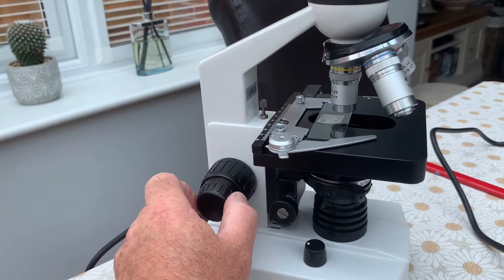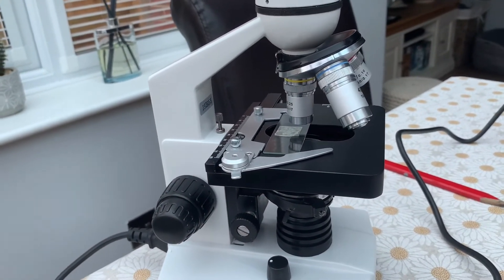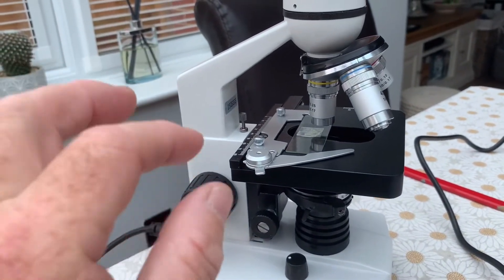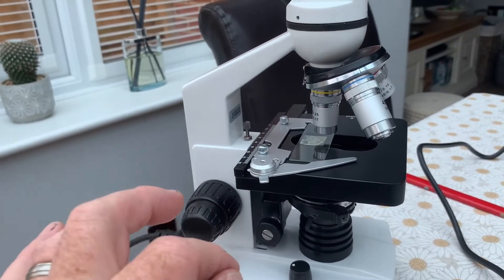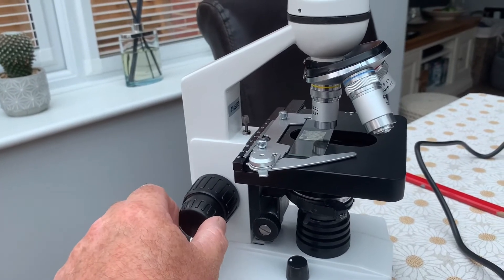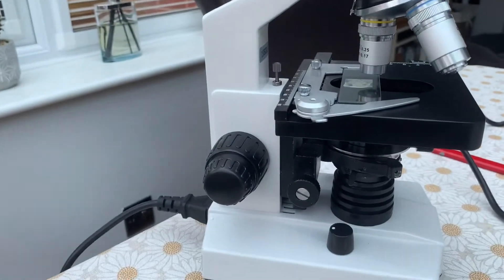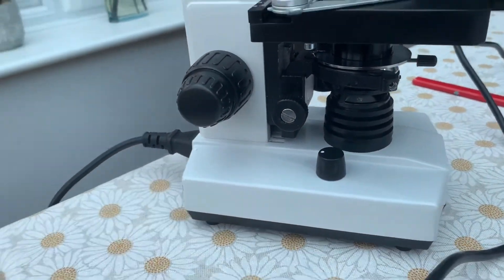You bring the stage up with the coarse focus until it's roughly in focus, then use the fine focus to dial it in. Sometimes when you're looking at a sample — especially if you've got a thick bit of mucus from a fish — part of it will be in focus but you might see something underneath, so you just play with the fine focus to get it up and down. Make sure you have a fine focus.